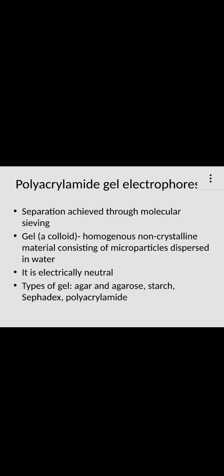Separation in PAGE is achieved through molecular sieving. This gel has small pores through which molecules will be migrating, and because of the interaction of the pores and the molecular size, sieving is achieved.